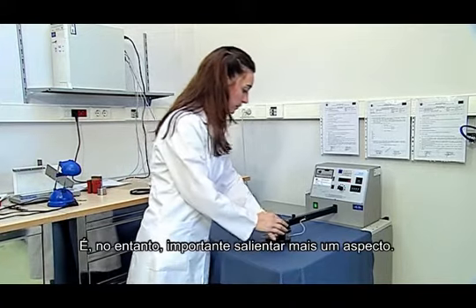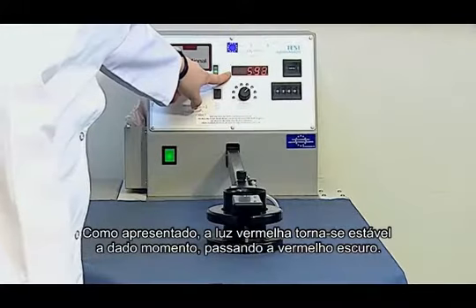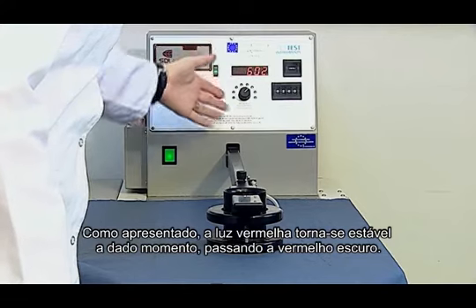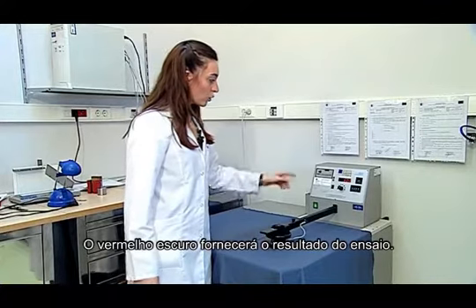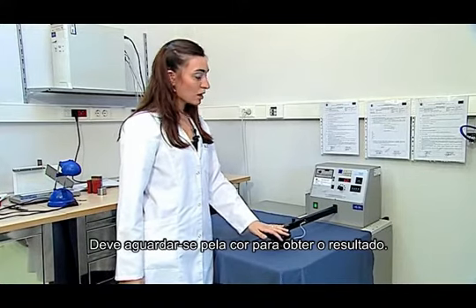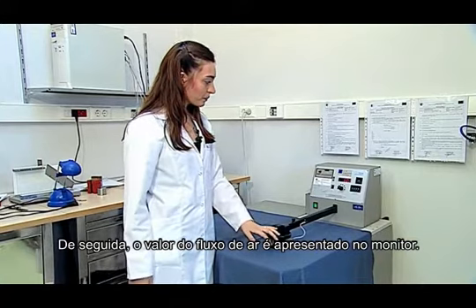But I want to underline one more point. I retest the sample. As shown, after a while, red becomes stable at some point, and it becomes dark red. Dark red gives the actual result of the sample. We are waiting for dark red to obtain the test result. Then, the airflow value is read on the screen.